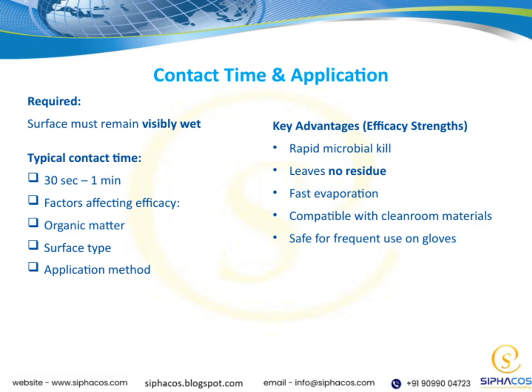The type of surface also matters. Some materials may require longer contact times or different application techniques. And finally, how you apply the disinfectant, whether by spray, wipe, or immersion, can influence how well it works. Keeping these points in mind helps us maximize the disinfectant's effectiveness and ensure a safe, clean environment.